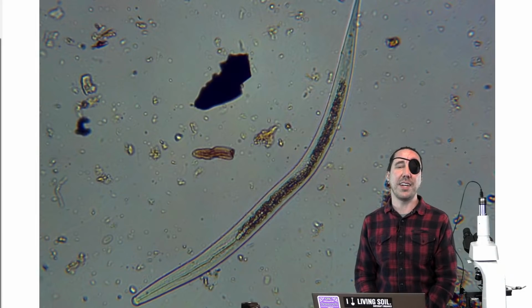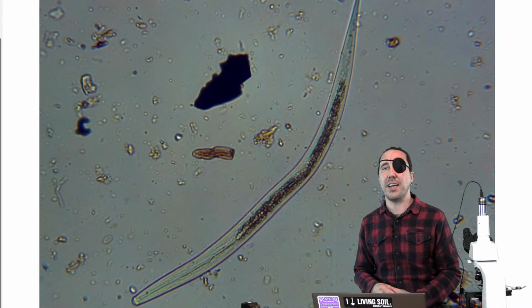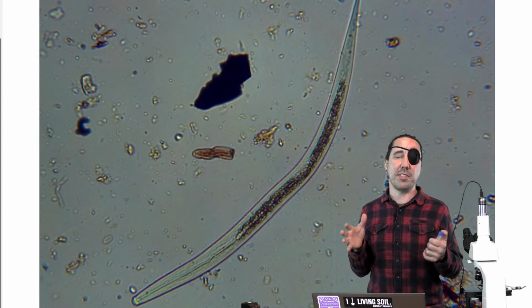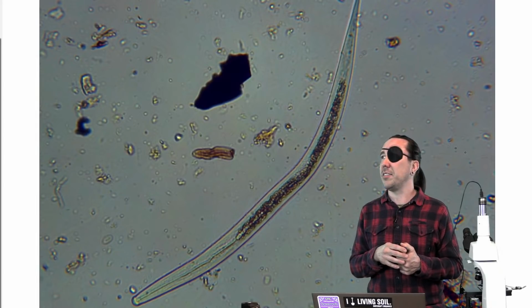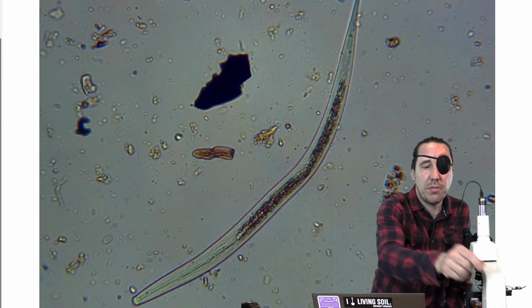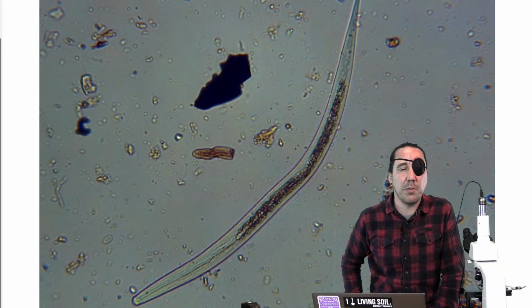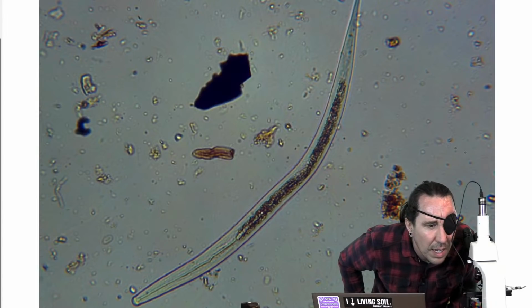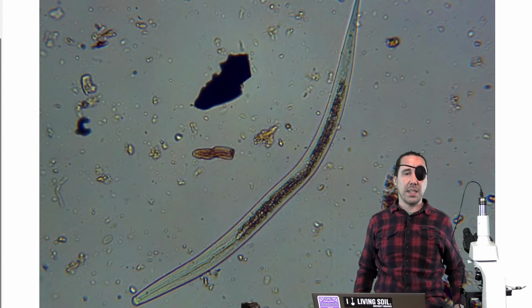This is the same sample. Oh, okay. That's funny. So this is from the same sample that we were just looking at, but he was mentioning that he thought the compost had dried out. So a year ago, he had viewed this same sample or same material and found this giant nematode, which I don't know how to make the screen move on his computer, but it looks like it's really big. It's hard to tell.